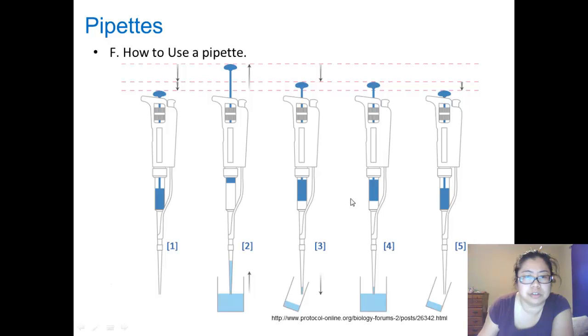So how do you use a pipette? The very first step is that you take the pipette, you set it to how much you need, and then you put your thumb on the plunger. Once it's on the plunger, you would push down to the first stop only.